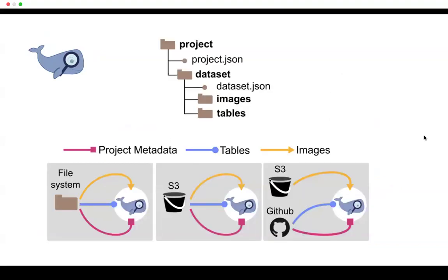So MoBIE data, the concept is we have projects. So in each project is a folder structure with images and we also support tables. And we have here this dataset.json file where actually all the paths to the images are stored and also the transformations and things like display settings so the image be painted green and what are the contrast limits and stuff like that. So we support doing everything local from the file system. We also support fetching everything from an object store. And then we support here some mixed mode, which we actually most commonly use, where all the images, so all the big data comes from the object store. But then the tables and the metadata we actually host on GitHub. And this is very convenient because on GitHub you can collaboratively work on this project and change things even with versioning.